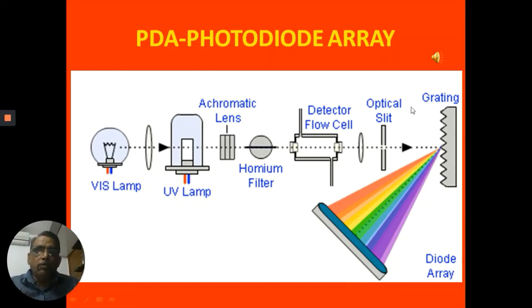So you will always see something like 1,024 elements of diodes arranged as an array, a single line linear array, which really facilitates the measurement of the entire spectral distribution of the light intensity. This is very, very important for the spectral measurements in a faster mode.